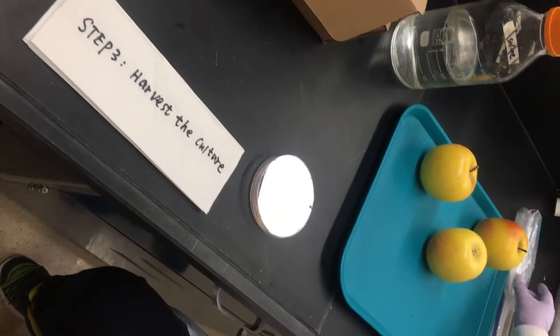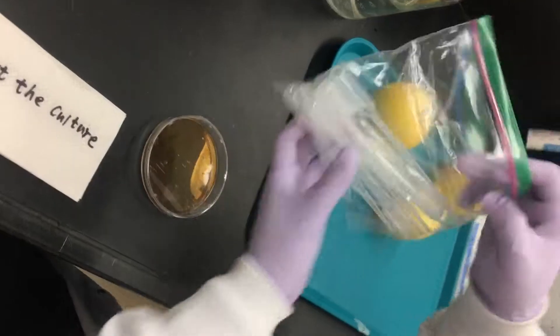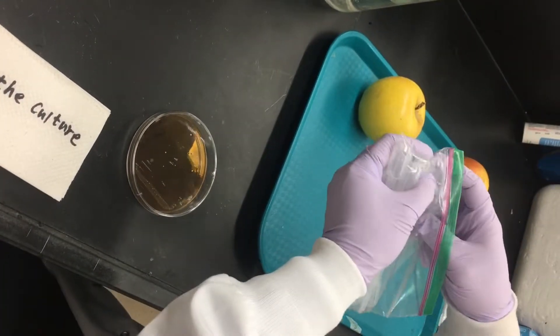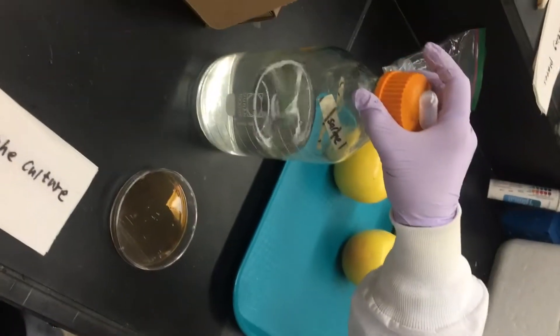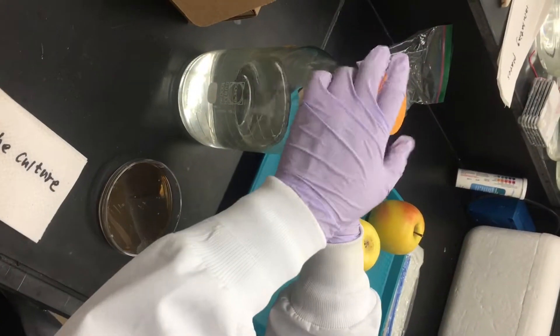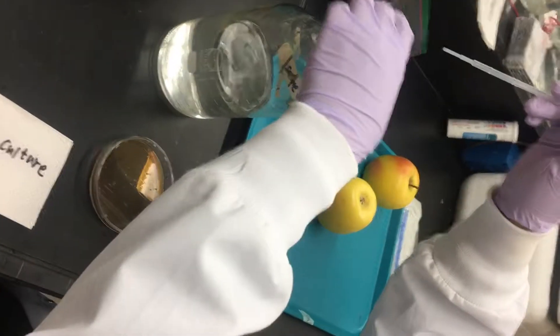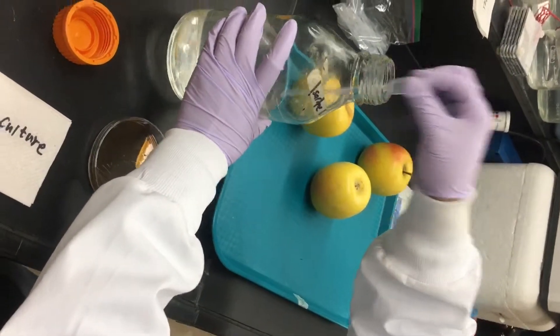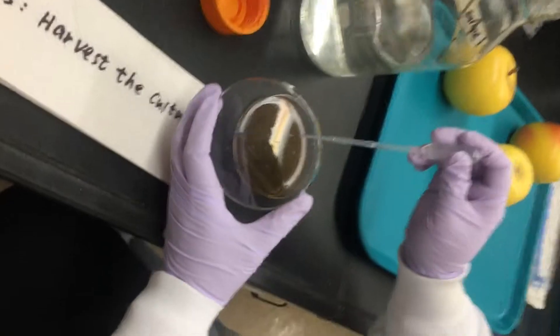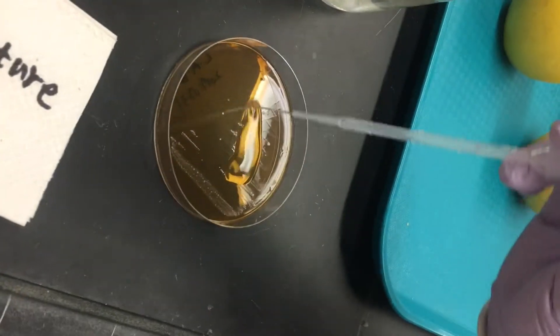Prepare the transfer pipette and sterilized water. You can use baby water instead of sterilized water. Put the pipette and put it on the plates.